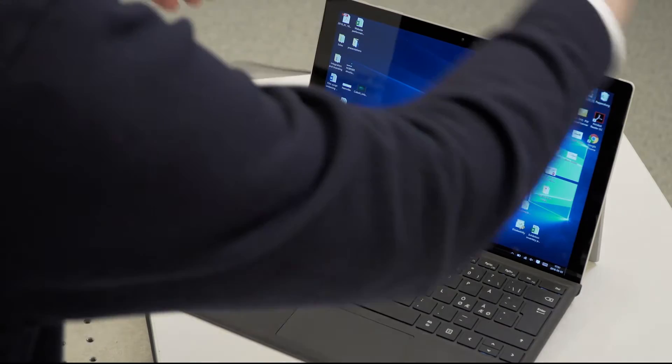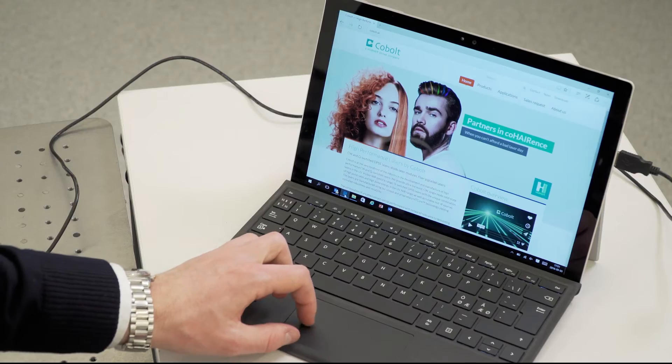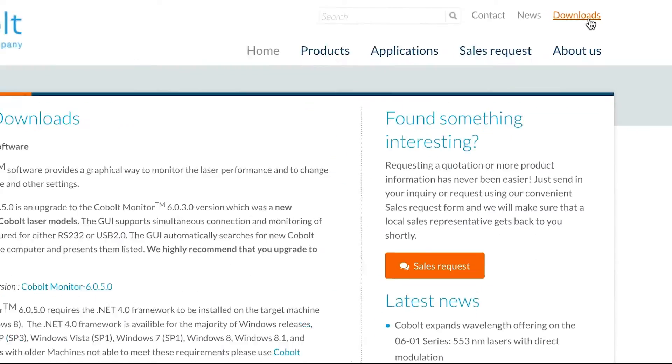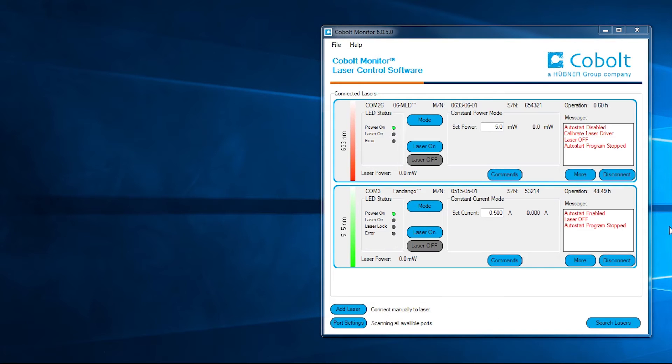Once your laser system is set up and ready to run, you can use our software to control and monitor the performance. The Cobolt Monitor software is downloaded directly from the Cobolt website. The software allows simultaneous control of multiple Cobolt lasers, which are automatically detected.